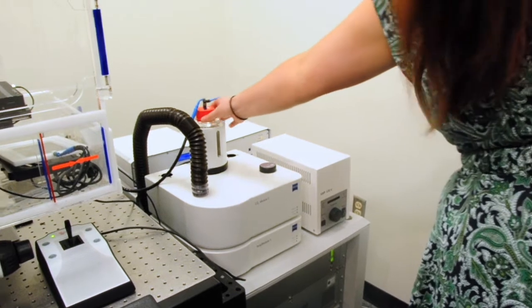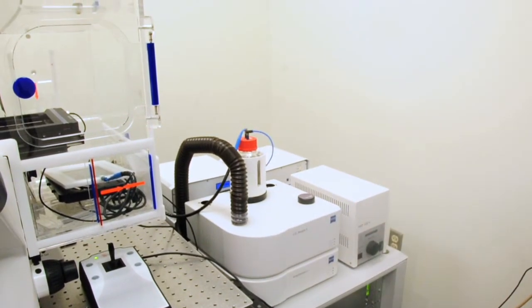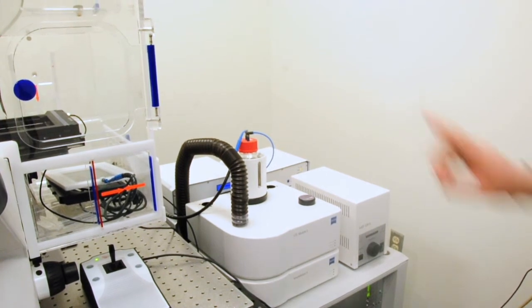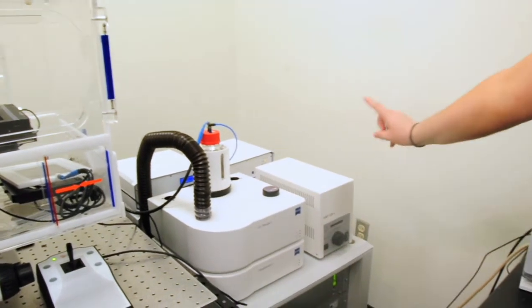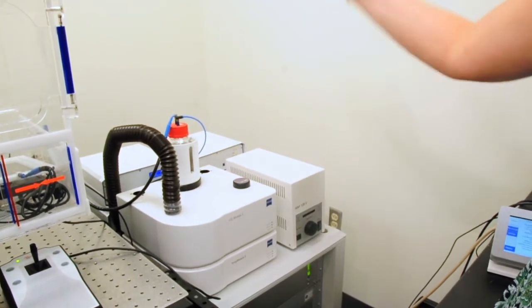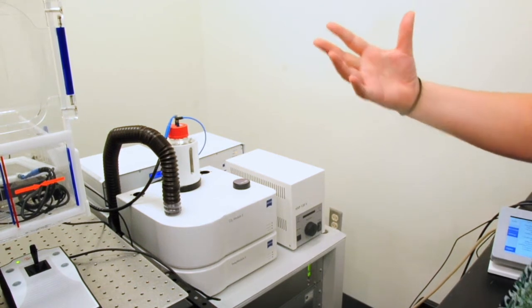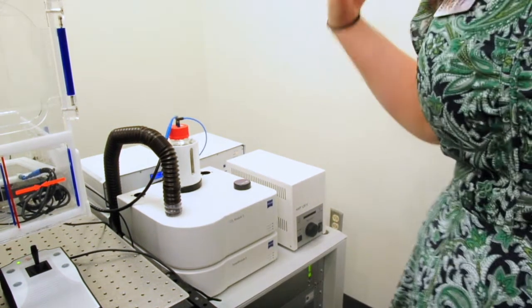This is bubbled through water so that it stays humid and we don't have evaporation when we're doing live cell imaging. And to the right, we have our HXP120, a metal halide light source so that we can look at the cells through the eyepieces because we can't look at our samples with lasers.